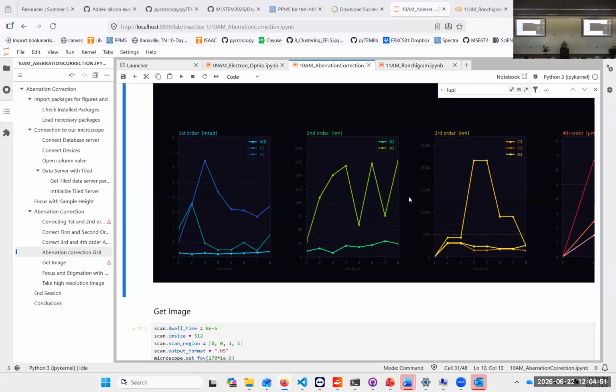So there's lots of things to be done with machine learning and training. We have all the data in principle, right? Everybody is changing the aberration corrector in the morning, hopefully, to get the resolution. So there are lots of different data sets. The point is to collect them.